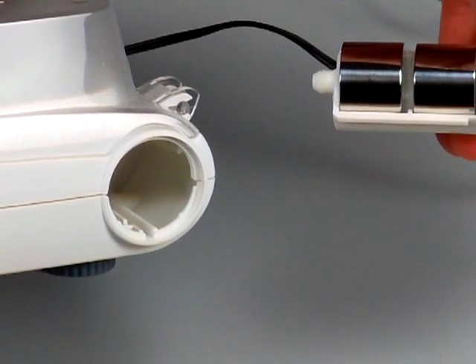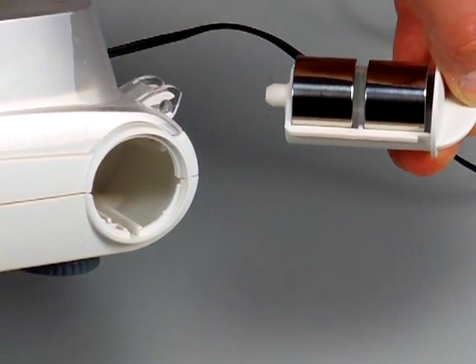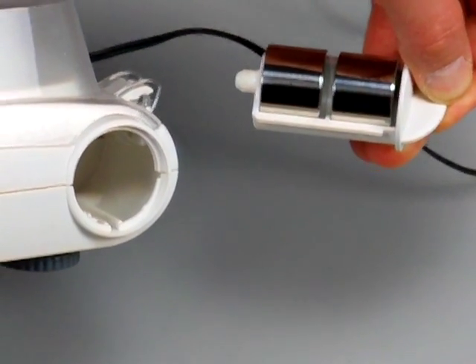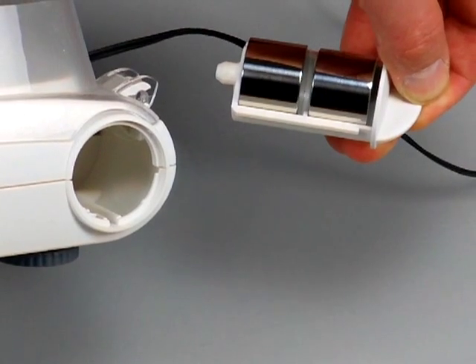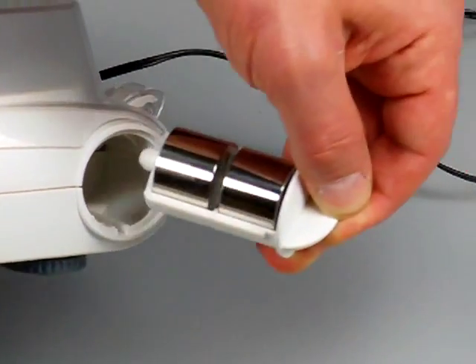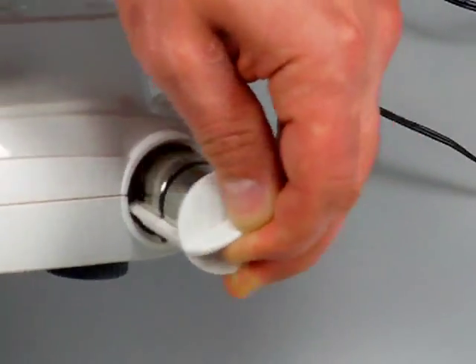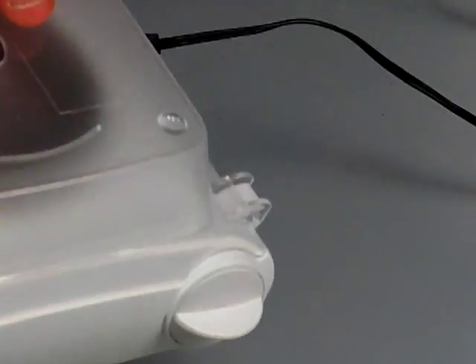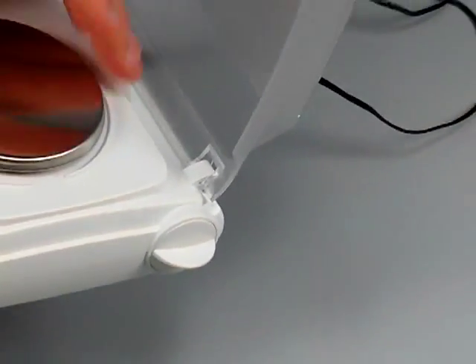For those models that do come with the calibration weights, I believe all the models up to 600 gram weighing capacity come with them. So if you buy a scale over 600 gram weighing capacity, the calibration weights are optional. But the cal weights go right into this little tiny compartment here and then it closes.